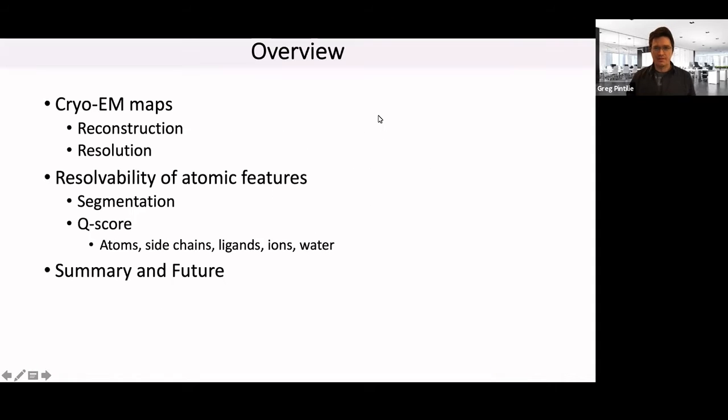Thank you very much for that introduction. It's great to be able to present some of the research. And as Kathy said, a lot of it does come out of the EMDR project and the challenges we've been doing. So just a quick overview of what I'll talk about. I'll briefly introduce cryo-EM maps, what they are, how we do the reconstruction, what we mean when we talk about the resolution of a map.